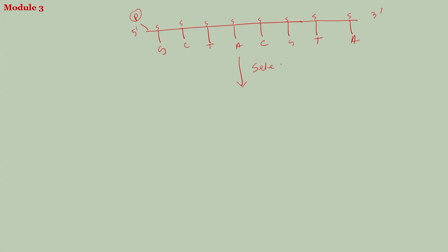So, we also will need a labeling here as well, and that is the first step that is being done, that selective labeling of this 5 prime phosphate by P32. This is usually done by enzyme.